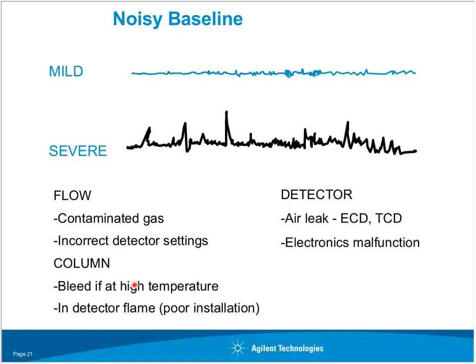Most customers, and I love you all, forgive me, but many people focus on the column as being the problem, and in many cases it's not the column, it's other things associated with it. It could be another issue within the detector flame, poor installation.